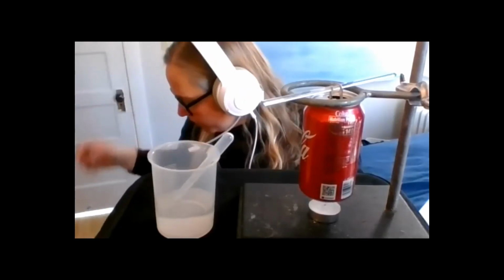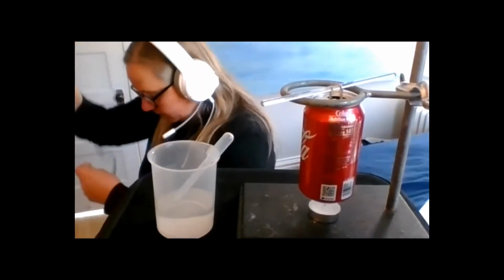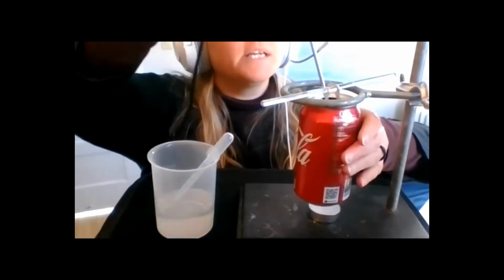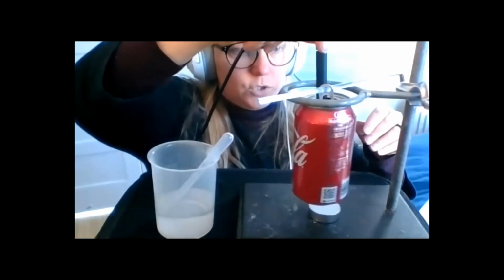And now if we could know how much energy the water absorbed, well, that would be great. And I'll show you how to use this thing in a little bit. But you're going to take your temperature probe and put it inside of the can. And you can use it as a stir, that's fine. And this thing's pretty tough.